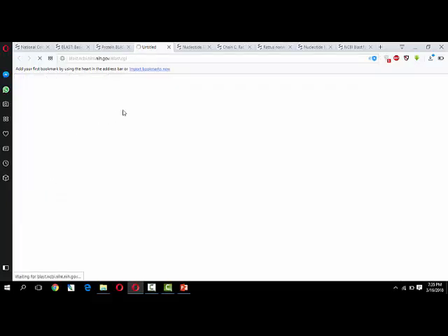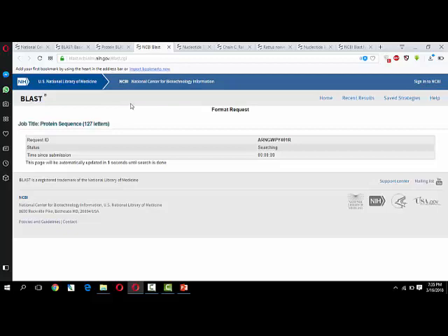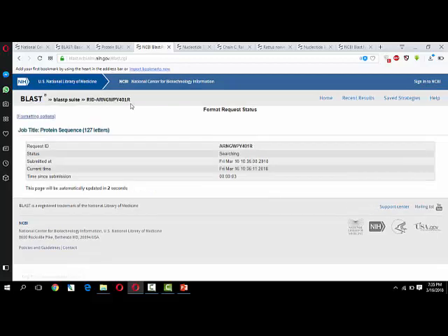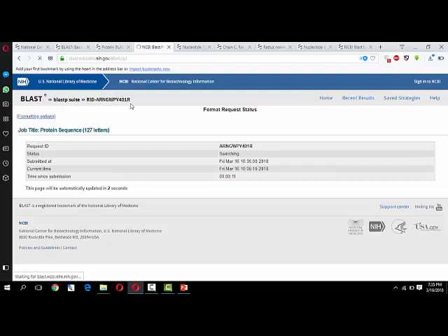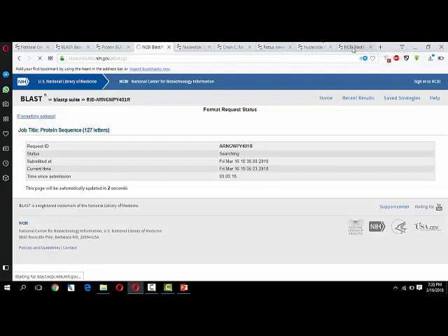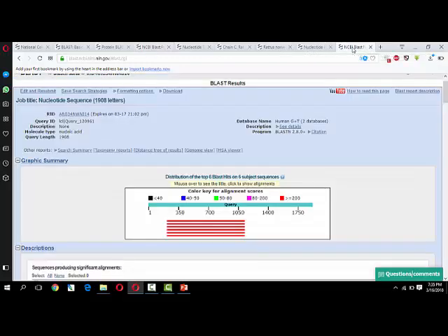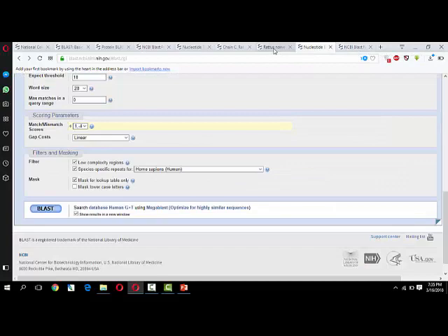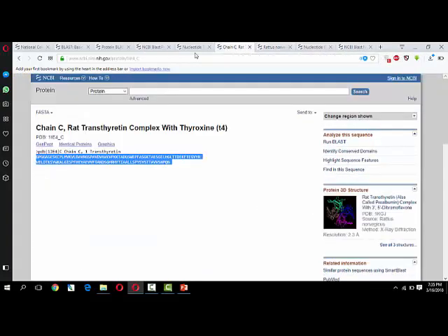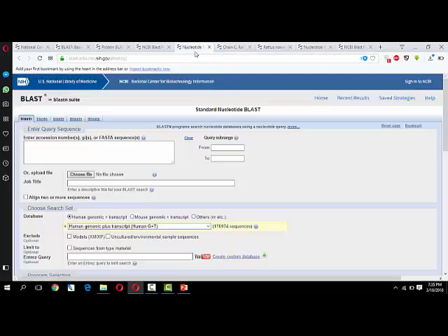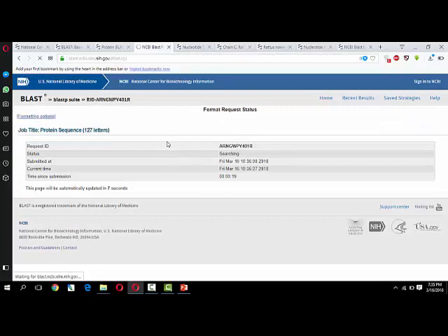You will get your desired results. It will take some time - it could take from a few seconds to some minutes. It depends on your internet connection. I already opened the sequences and similarity indices for our nucleotides because it is a heavy database and it works a little bit slowly. It requires some time.